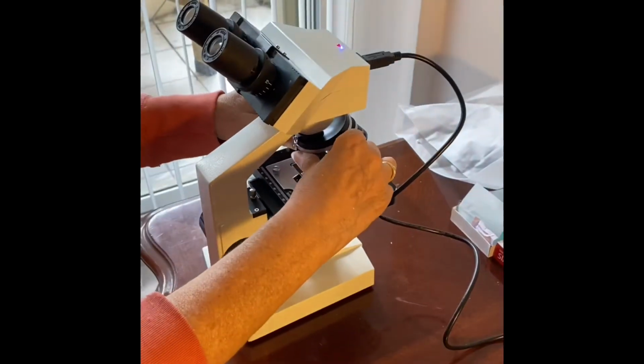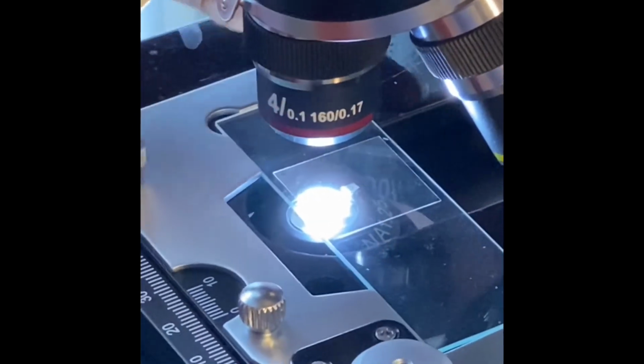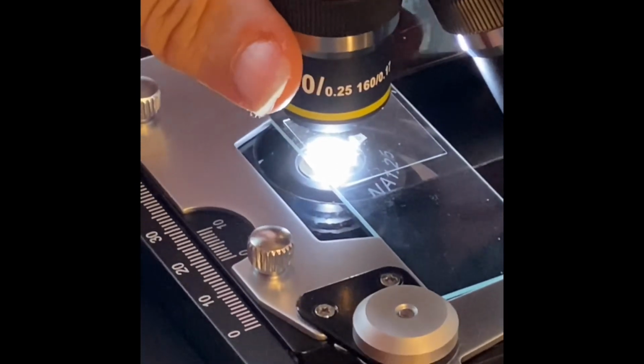Then as you move clockwise, the powers become higher and higher. The first objective, which is the shortest, has a total magnification of 4x. The second objective has a magnification of 10x.